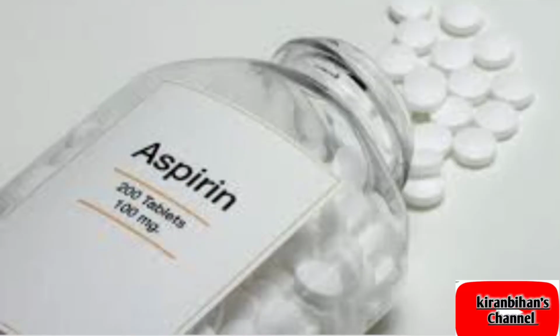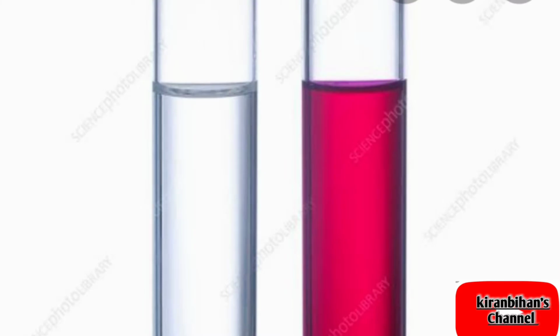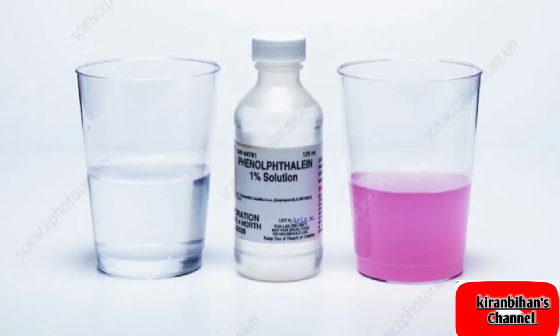Hello everyone, today we are going to perform the analysis of aspirin. We will perform the analysis of aspirin by phenolphthalein and its color. We will see the pink and white by two ingredients.